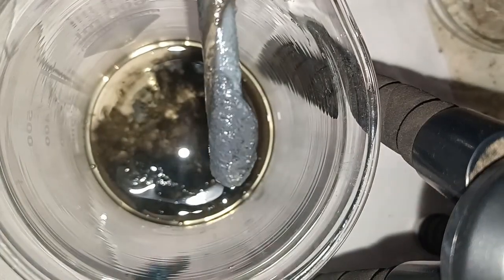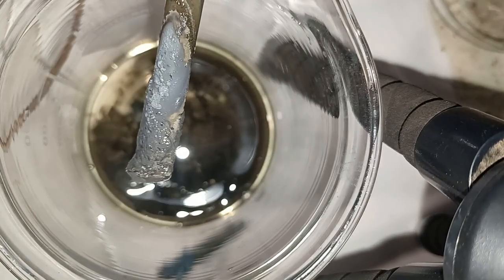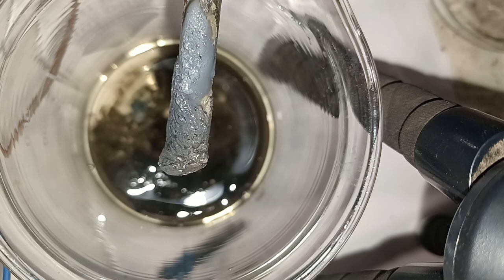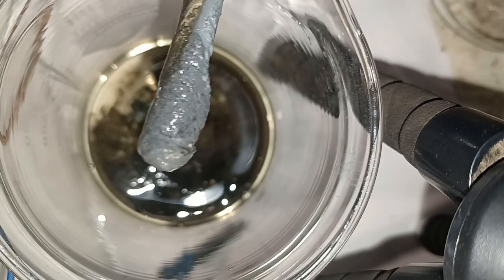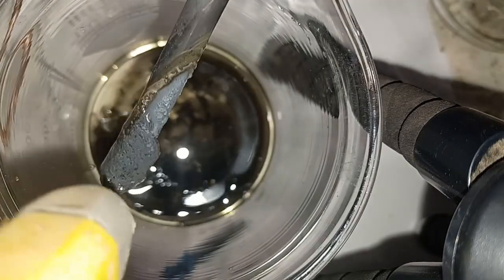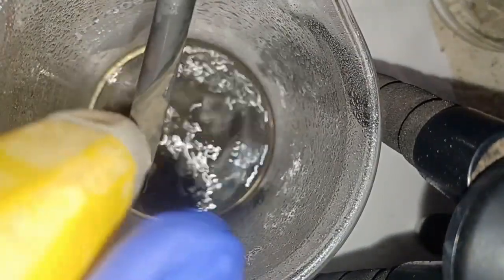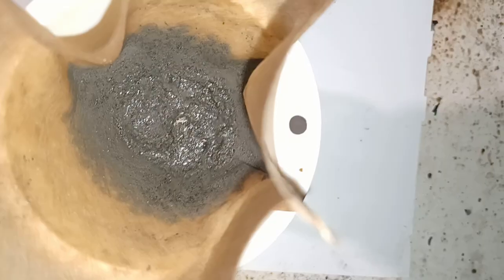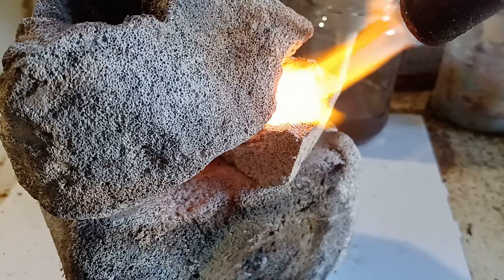Silver produced by electrolysis is similar to silver made by cementation, because those two methods are similar — the only thing that differs is the source of the electrons. This grayish goop is, in truth, very small silver crystals. I dried the silver and melted it down with a flux that was a one-to-one mixture of borax and sodium carbonate.